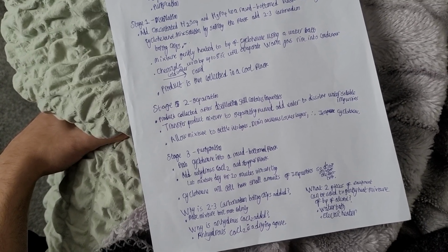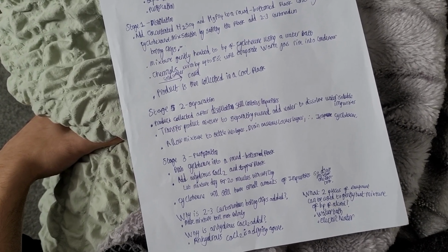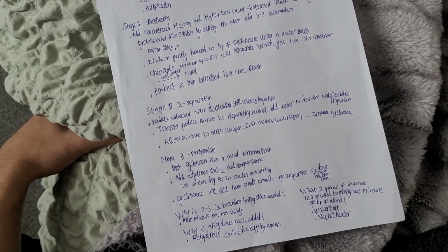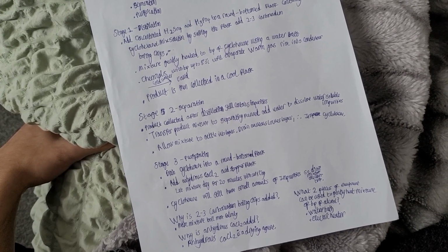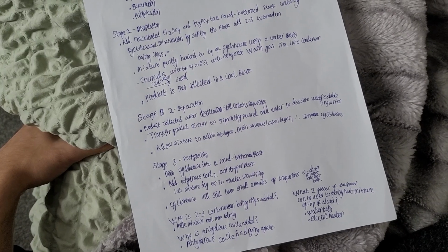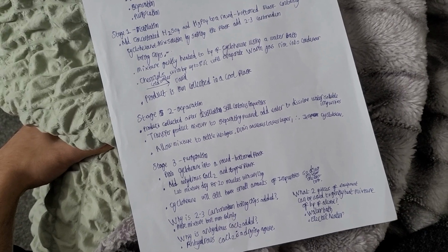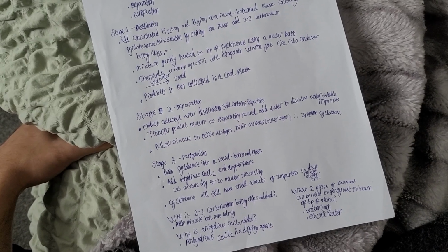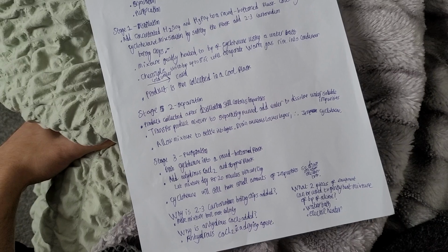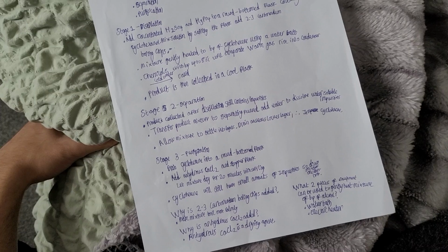Stage 2 separation. The product collected after distillation still contains impurities, so we want to transfer the product mixture to a separating funnel and add water to dissolve water-soluble impurities. We want to allow the mixture to settle into layers, and once it has settled, we want to drain the aqueous lower layer, leaving the impure cyclohexene. Stage 3 purification. Drain cyclohexene into a round bottom flask and add anhydrous calcium chloride and stopper the flask. Let the mixture dry for 20 minutes with swirling, and the cyclohexene will still have small amounts of impurities, so distill the mixture one last time. And that is it for this practical.